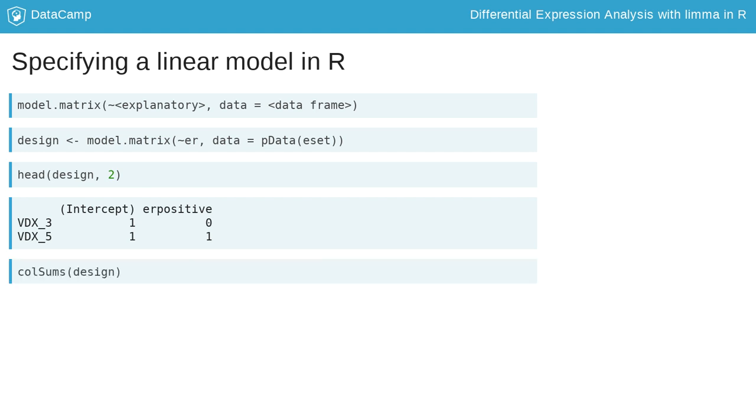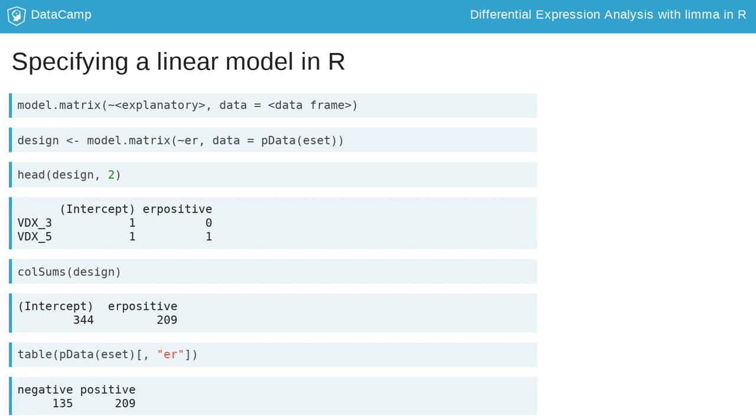Summing the columns of the design matrix is a good sanity check. The number of samples modeled by the ER coefficient should equal the number of ER positive samples, 209.